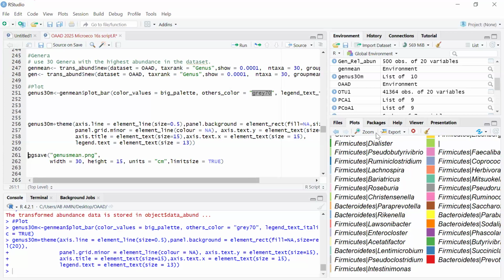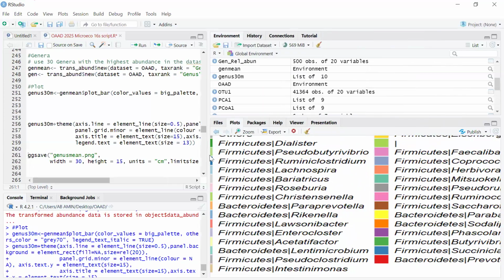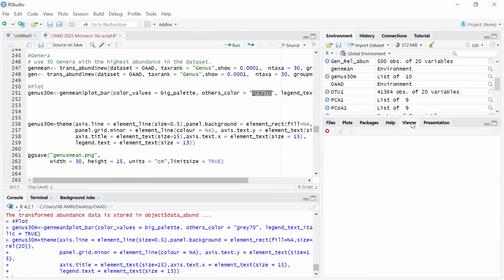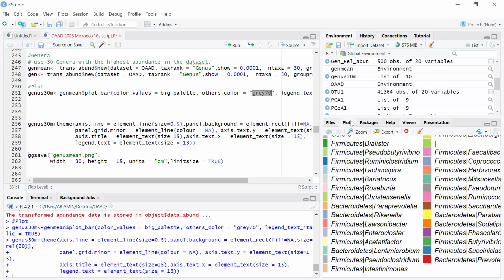You can drag it up. You can also use the viewer so that we can view it in the complete mode. The problem is if you use viewer or Zoom, it will open another page, so he will have to share that page. Oh, you have not been seeing the plots I've been opening here because I only shared the page.